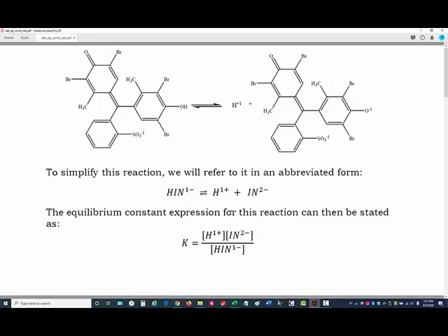So the lab is about determining this equilibrium constant, and so we will prepare several different solutions, and we will measure each of these three quantities and then compute the equilibrium constant from it. We'll do it for 3 different samples, and then you can average the value to report a final equilibrium constant.